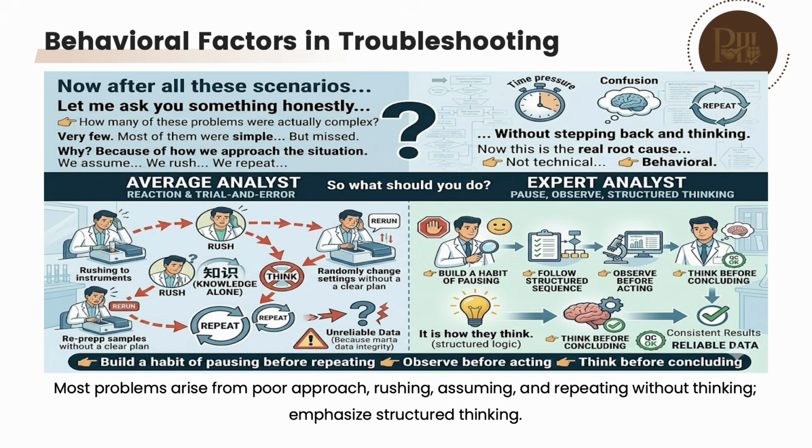So, what should you do? Build a habit of pausing before repeating. Follow a structured troubleshooting sequence. Observe before acting. Think before concluding. Because the difference between an average analyst and an expert is not knowledge alone, it is how they think.